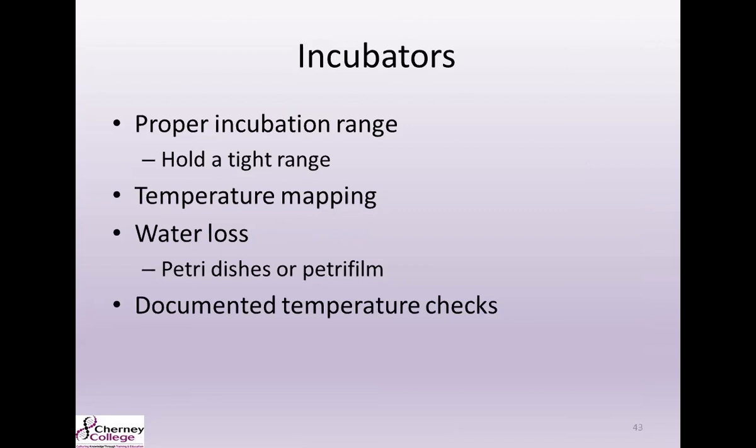As far as incubators, you're going to want to make sure that the incubator can hold a tight range. Whatever your method specifies, you want to make sure that it's capable of maintaining that strict temperature limit specified in your methods. Whenever you get a new incubator in the lab, you're going to want to assess it for water loss and temperature mapping.